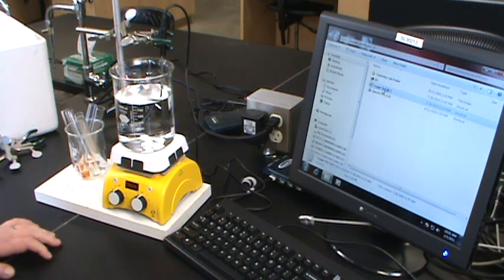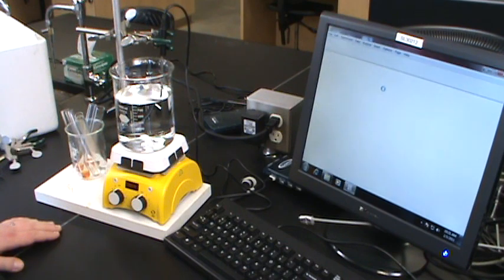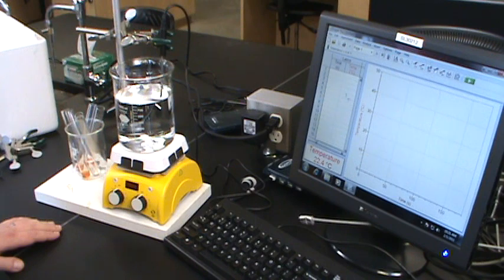Now, we're not really going to be using the data from Logger Pro for anything, but it makes for a pretty convenient way to just visually see what's going on. So Logger Pro is going to load up. It detects that there's a temperature probe attached, and right now it looks like my water is at about 22.4 degrees C. We're going to set this up to do a data collection, but again, it's not a data collection that we're going to use for anything in a calculation, really. It's going to be something that we're going to use to observe what's going on with our bath.